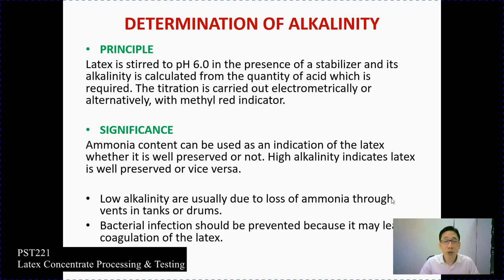That's why usually we will keep on measuring the latex via the schedule. Although initially when you measure, the ammonia in the latex is stable enough for high ammonia content, maybe after 24 hours, or 48 hours, you need to remeasure it again, because the ammonia might evaporate and the amounts of ammonia will reduce significantly.